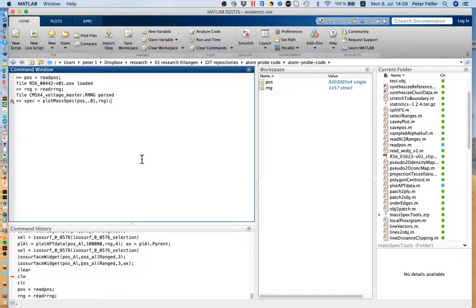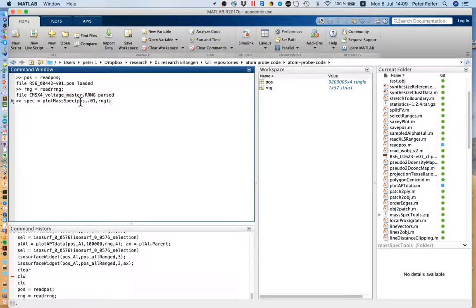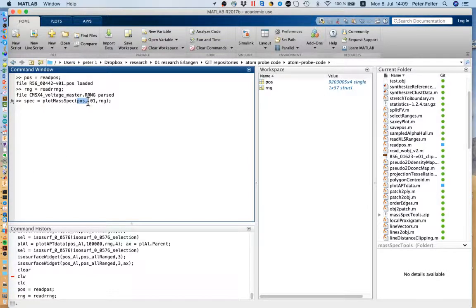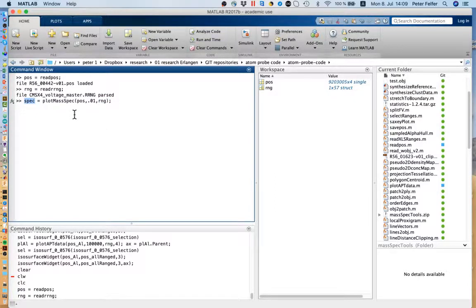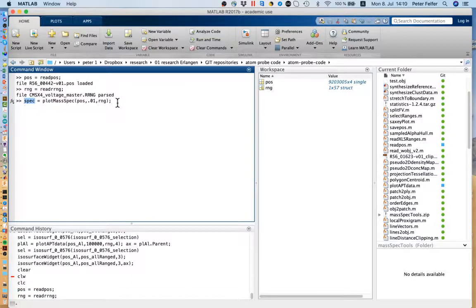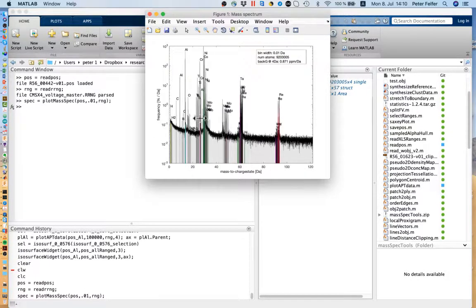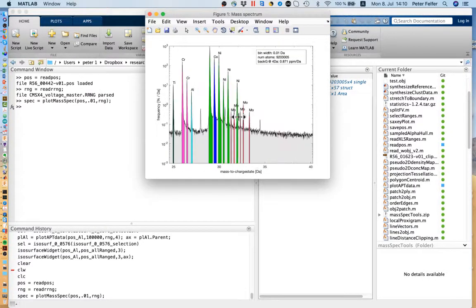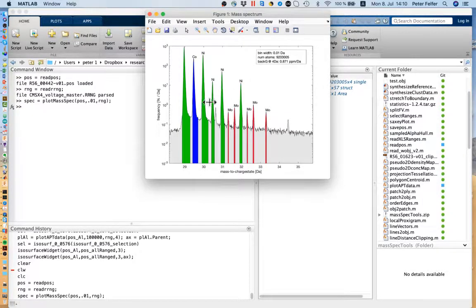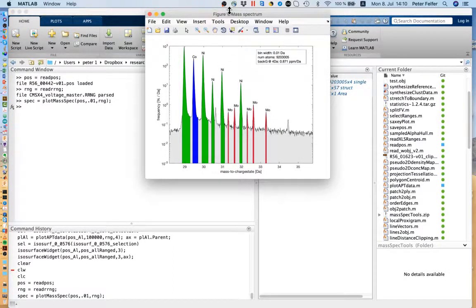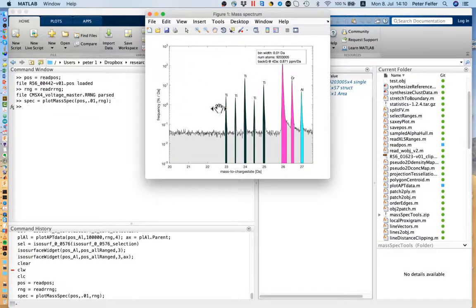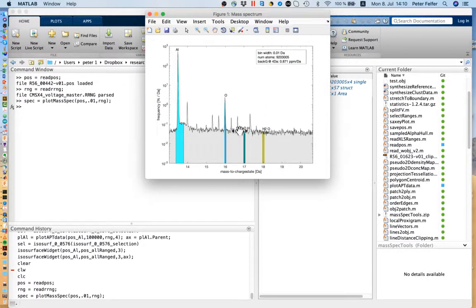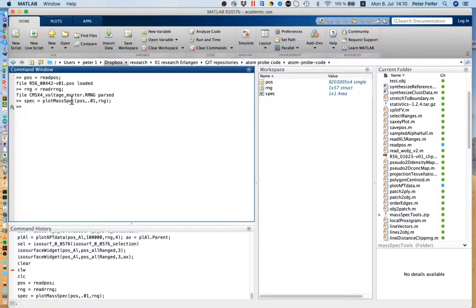The first update I want to show you is that now you can actually plot the mass spectrum including the ranges. This new updated plot mass spectrum command allows you to put in which POS file you want to do the plot for, what the binning is supposed to be, the mass-to-charge binning in Daltons, and then you can add some ranges. What you get as the output is the handle of the mass spectrum plot. You'll get a plot with all the different ranges labeled. This ranging file hasn't seen a lot of love, so there are a couple of peaks that are probably wrong and a couple of peaks that are probably at the wrong spot, but it does the drawing pretty nicely.